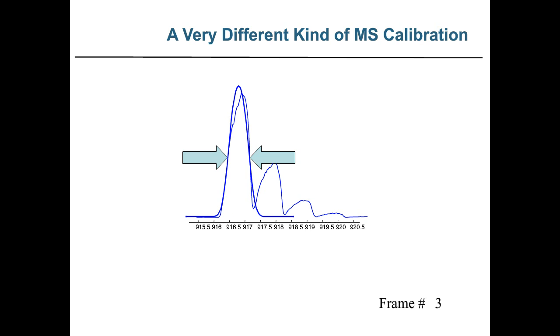That's very common. It doesn't have to be, but we can choose a Gaussian, which has approximately the same line width as our measured line width from our mass spectrometer. The difference is, of course, now it's an analytically defined function, unlike the measurement in our mass spectrometer, which is an undefined function. We don't know what that line shape function is.